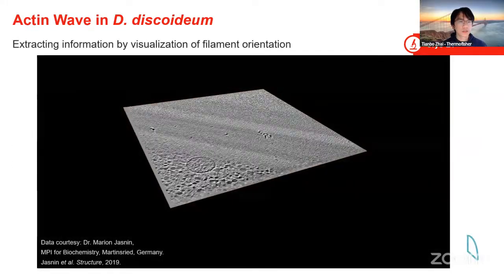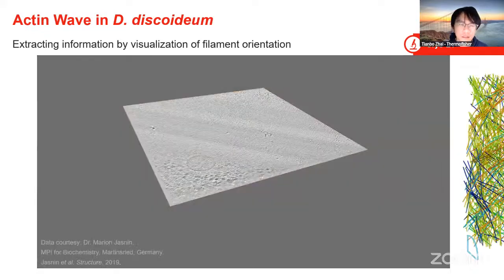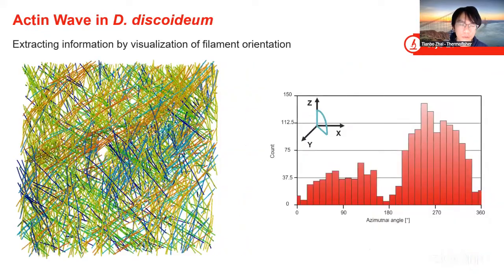Size limitation, I would say that if you're worried that the tube is really big, then the correlation template wouldn't allow that parameter, for example, the diameter of the cylinder, to be input. I didn't notice a specific limit on that, because you have two ways you can input it.